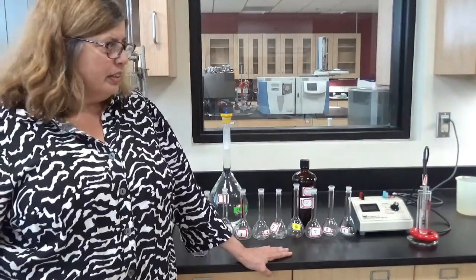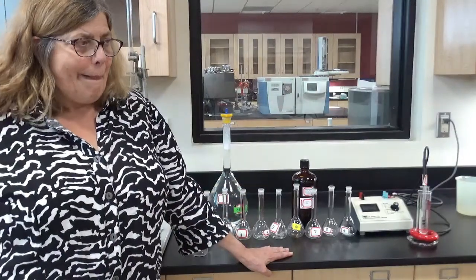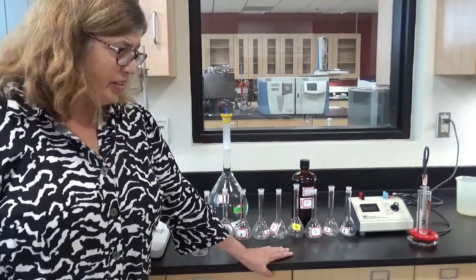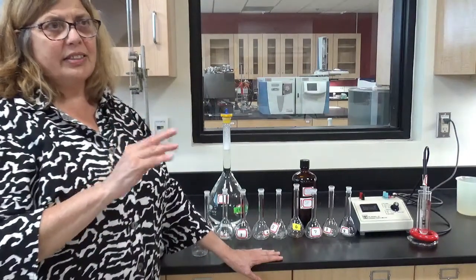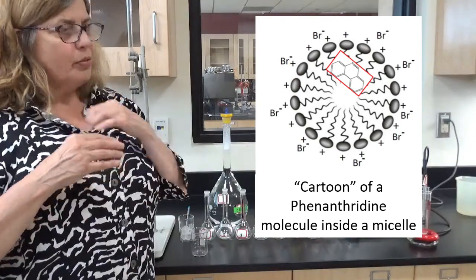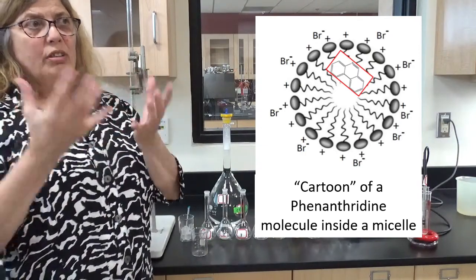That's very nice. Okay, so what happens when I add it to these different solutions that have different concentrations of CTAB? Well, the phenanthridine fluorescence is influenced by whether there's micelles around, okay? If micelles start to form, then these phenanthridine molecules will actually enter into the center of the micelles. Maybe I didn't tell you this, but maybe you could get it from reading the lab handout, the way these micelles form is that their hydrocarbon tails all entangle inside the middle of the micelle, and the heads, which are polar, are on the outside.